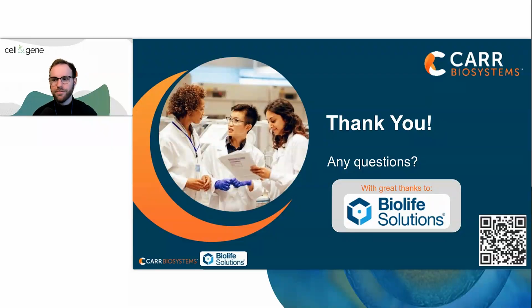Our first question: for organizations currently relying on manual centrifugation, what is the biggest operational advantage they would notice moving to an automated closed process?